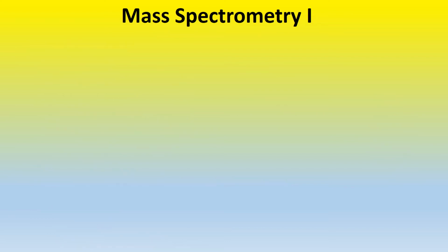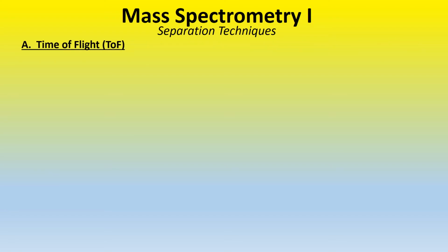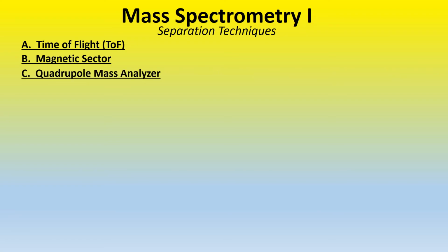So there are multiple separation techniques: time of flight, magnetic sector, and the newest and most versatile in terms of development, quadrupole mass analysis.